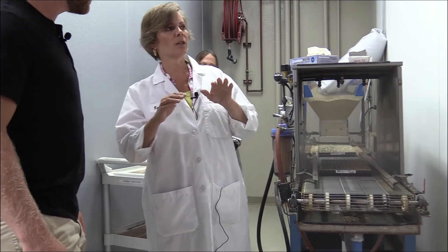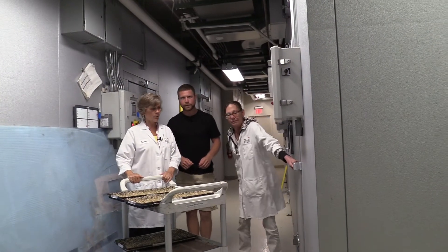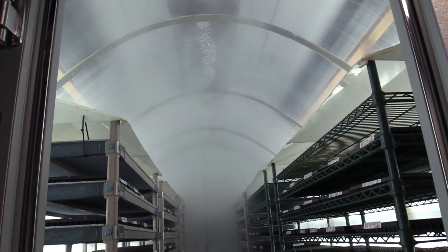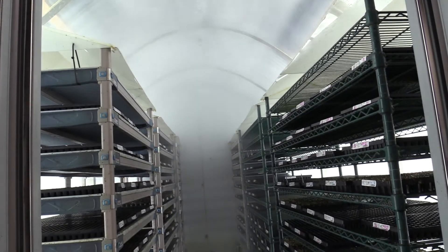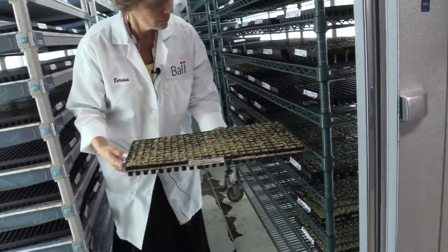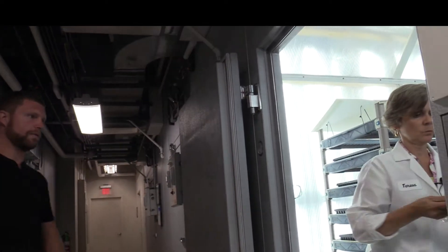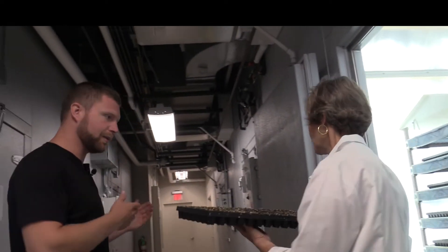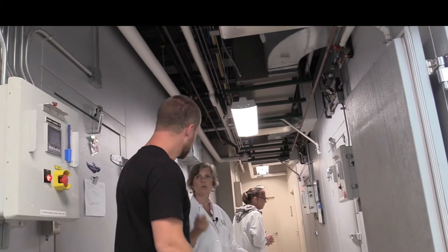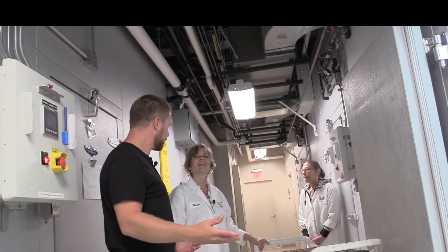Most commercial growers will have a chamber where the actual germination starts, so we're going to put this into a mist chamber at about 100% relative humidity — this is where germination starts. We're going from the germination chamber into another chamber. This is our mist chamber, and then we're going to go into our growth chamber. It's a little bit more light in there — yes, a lot more light — and we have automatic watering.